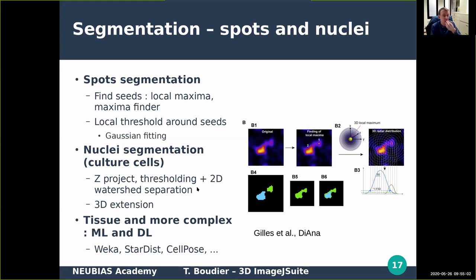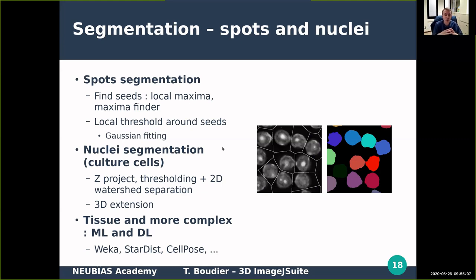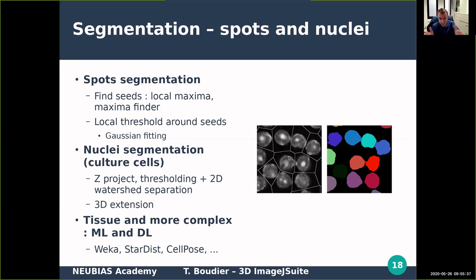In 2D, nuclear segmentation is not too difficult — you do a normal thresholding and then a 2D watershed to separate objects. The 3D approach is to detect the 3D image, do a maximum projection to a 2D plane, do the segmentation and separation in 2D, and then extend the segmentation in 3D to get 3D nuclei separated. Of course, nowadays you can just use machine learning or deep learning tools which work very well.